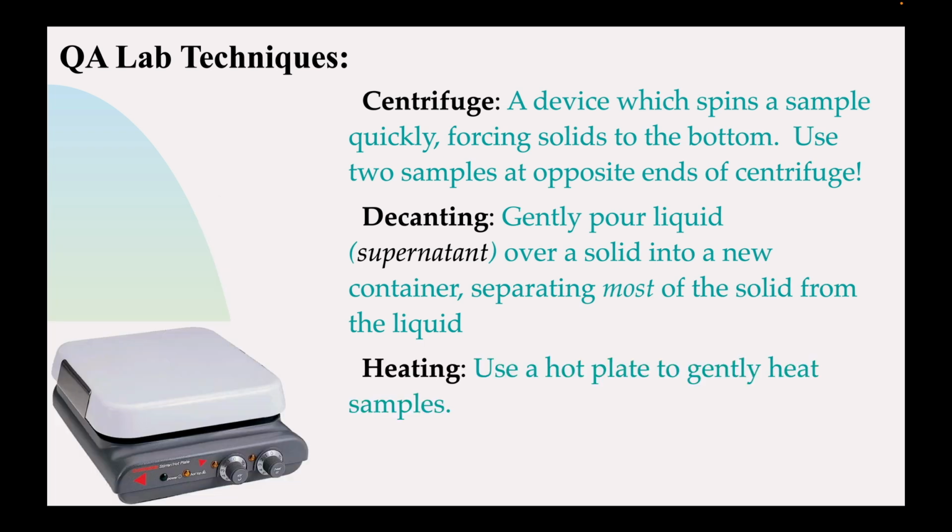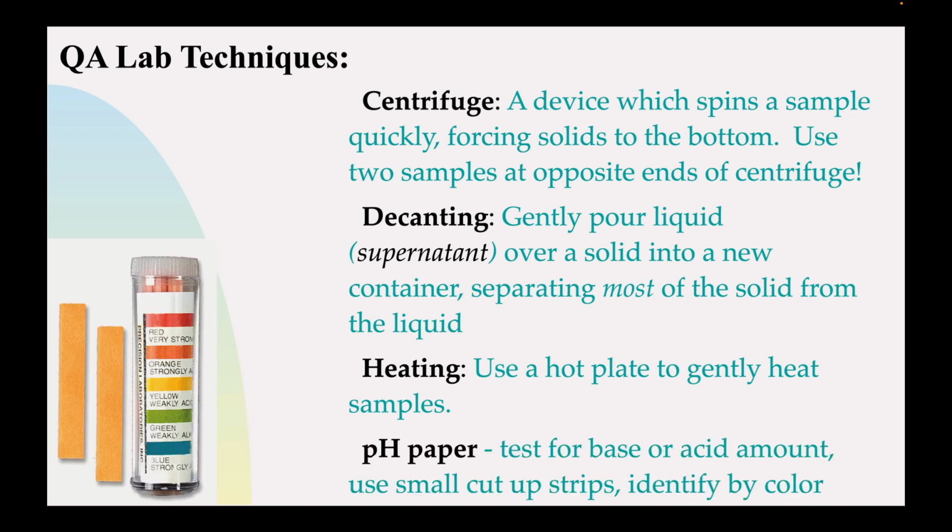We're going to be heating samples. In QA1, you'll be taking a beaker and heating it with water and then placing the sample inside there. Watch your samples. You never want to get a sample totally dry, because that'll cause solids to form and mess up your results. The hot plates can get pretty warm, so just FYI. You want to gently heat them and pay attention, don't start texting, or else you will seriously have some issues.